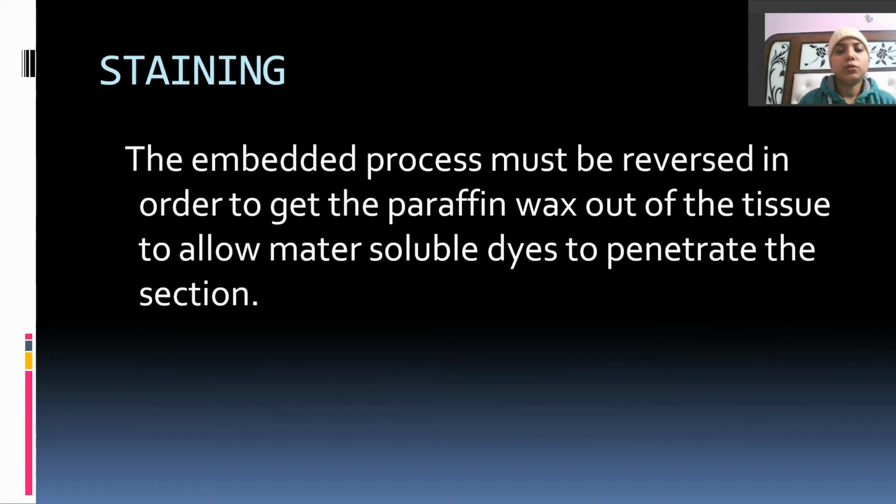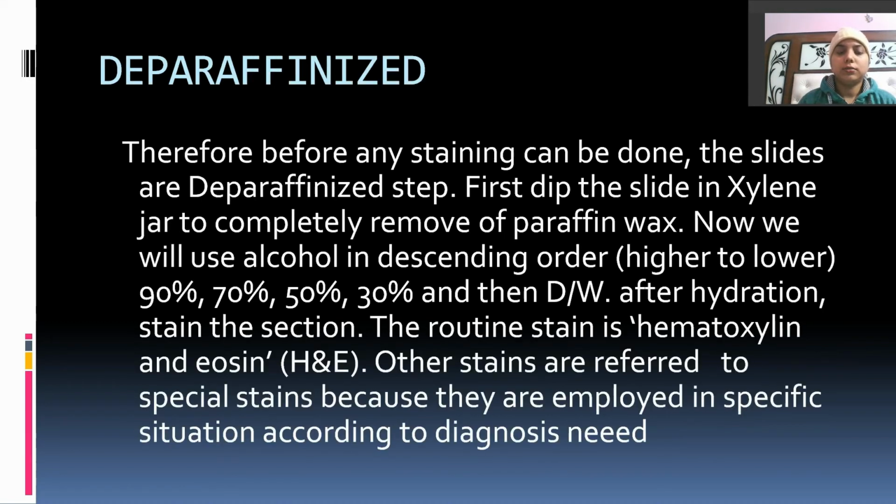The embedding process must be reversed in order to get the paraffin wax out of the tissue, to allow water-soluble dye to penetrate the section. Basically, after the staining on the slide, we have to mount the smear. But at the start of the staining, we have to deparaffinize the smear, so that the staining can be done. The slides are deparaffinized in steps.